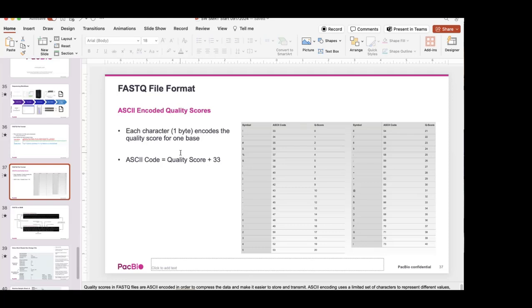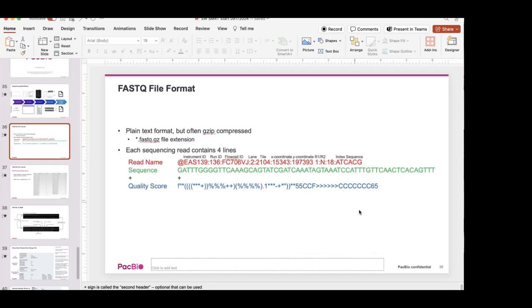It's just a lot of them assume that it's going to be Illumina formatted in the file name, but that doesn't change the contents of the data itself. So yeah, the answer is yes, with caveats. I guess the other caveat, yeah, sure.